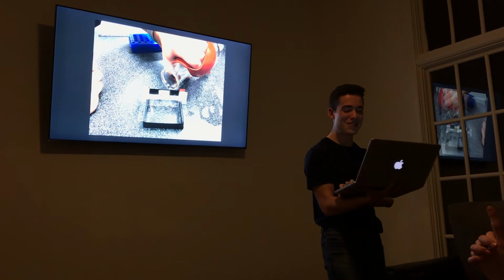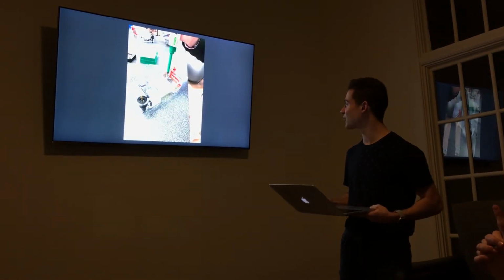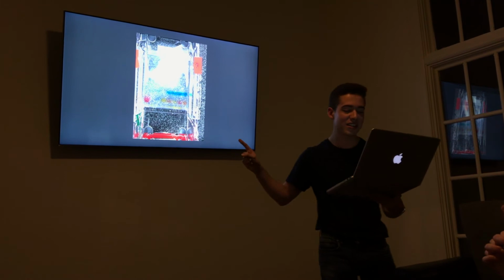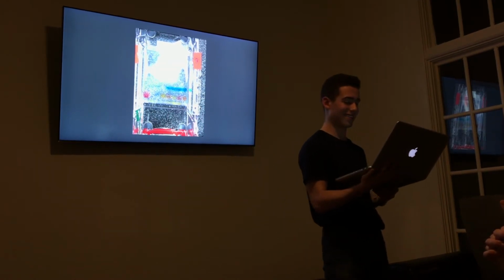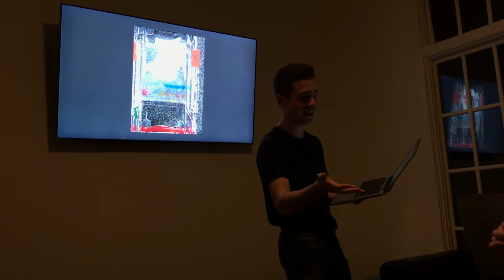Right here, you can see a clear picture of our different dyes being sorted out. Notice how the yellow has traveled the farthest. That's because the yellow dye had a lot less mass and structure to tangle itself up, unlike the strong and heavy blue dye. Now, we know that this technology is most likely going over your head.